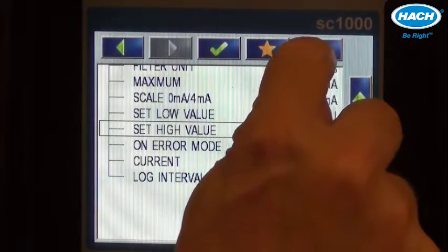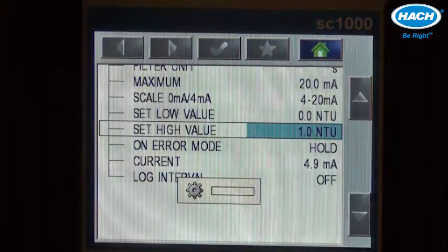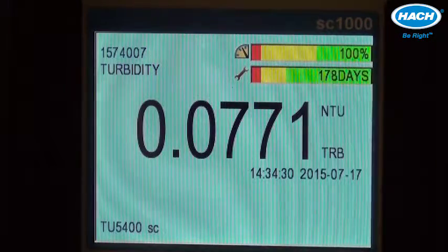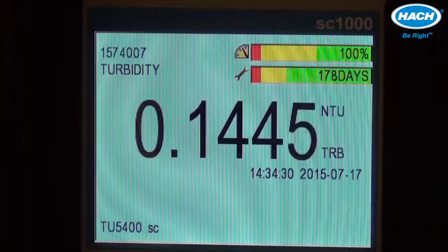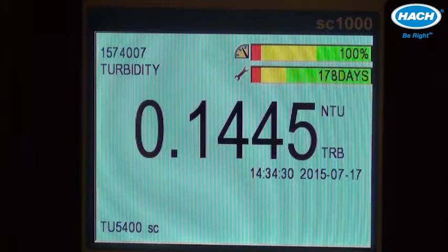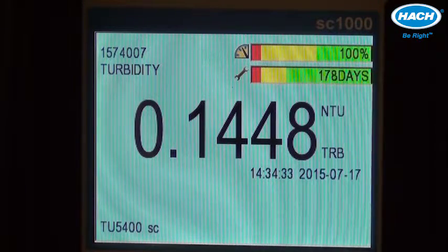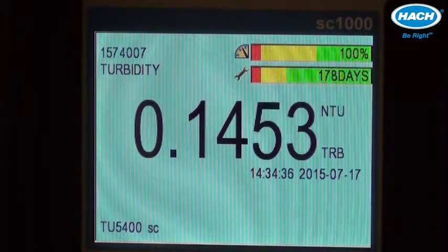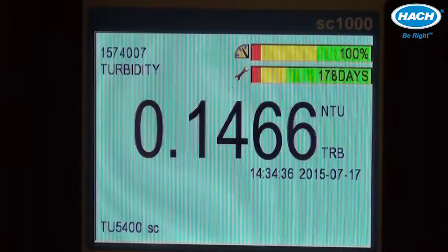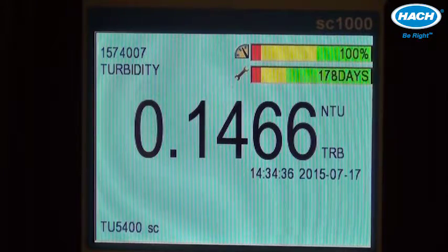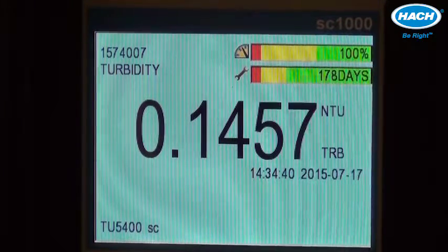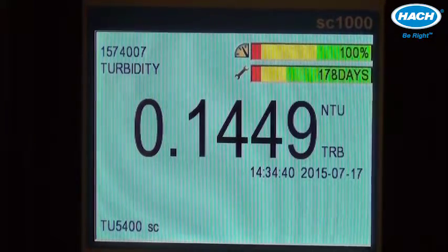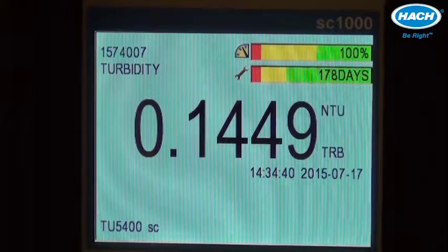We can go all the way back to the home menu by pressing the home icon, and we're done. This completes the simple installation of the TU5400 process turbidimeter using the SC1000 controller.